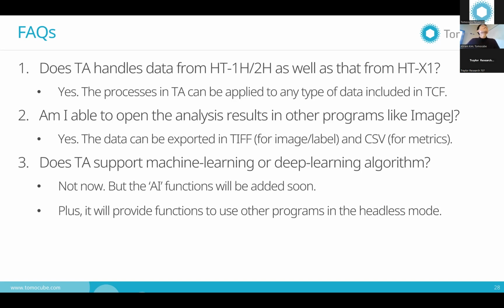Can you briefly explain how the image is optically collected? Is it similar to a conventional microscope? You are collecting the refractivity, right. The optical configuration is the same as a usual transmission light microscope, but how we acquire the refractive index is very different from most optical microscopes.